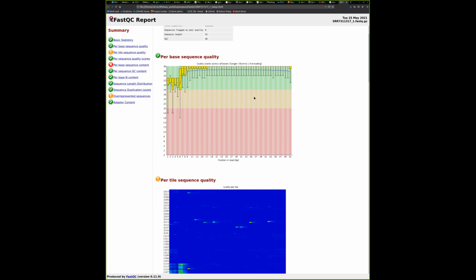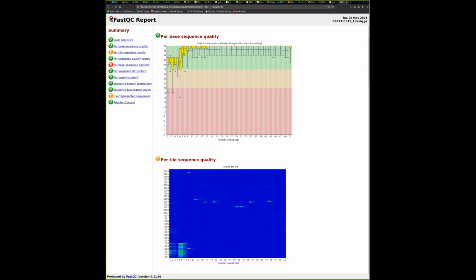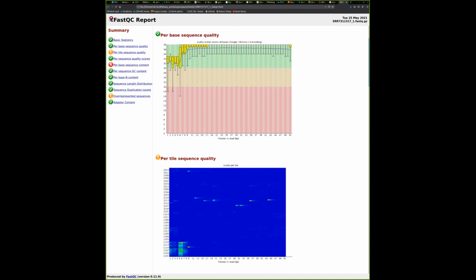This is a Phred 33 scoring system. And you can see that generally these are very good quality, although I myself will actually trim this a little bit more just to make sure that I remove this poor noise, this slightly lower quality at the 5' end, but generally this is something that looks very decent. You will see that the standard deviation, the range of this quality is very narrow, and it's all within this green zone. So this is something typical of a good sequencing experiment.